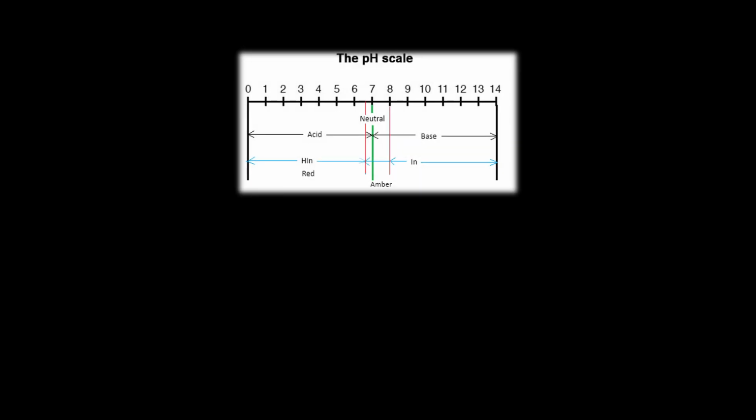It should be quite obvious now that one can track the pH of a titration, as indicators are used as a tool for detecting the equivalence point. If using a base as the titrant, with a few drops of an indicator added to an acid, the acid must have a pH value that is low enough to keep the indicator in its acidic state. To represent the indicator in its acidic state, the term HIN is used.